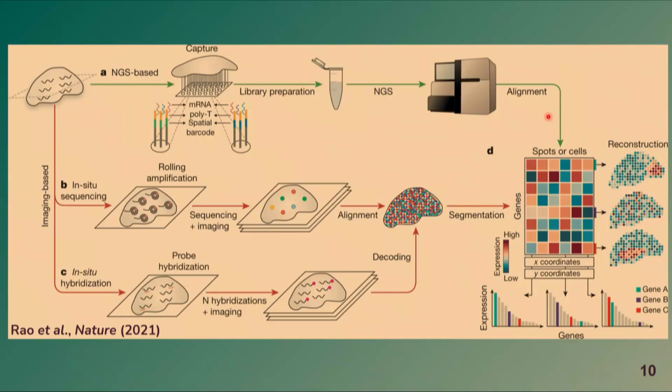That's why we can reconstruct this image from the spots. It's not in this slide, but in the next, that besides this genetic information, we also have staining information, hematoxylin and eosin, and this is the basic data that we use for the downstream analysis.